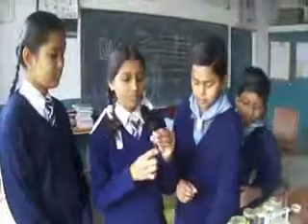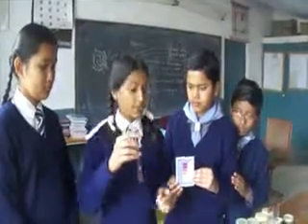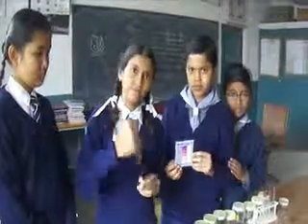Cork the test tube and shake it well so that the reagent mixes uniformly.